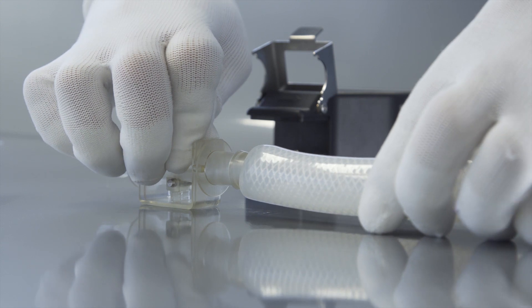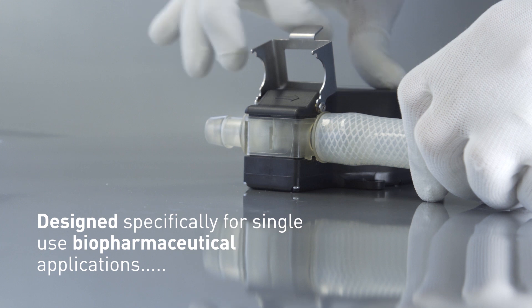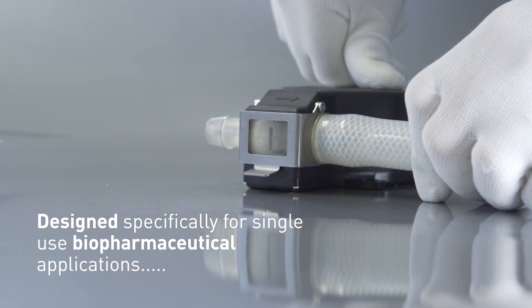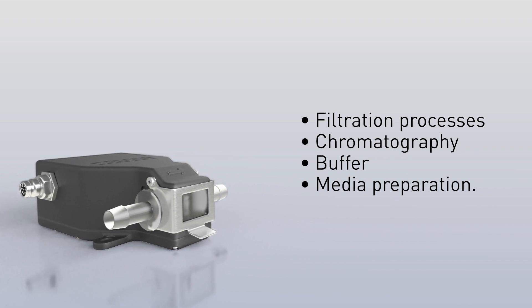The FlexMag features a disposable flow tube designed specifically for single-use biopharmaceutical applications such as filtration processes, chromatography, and buffer and media preparation.